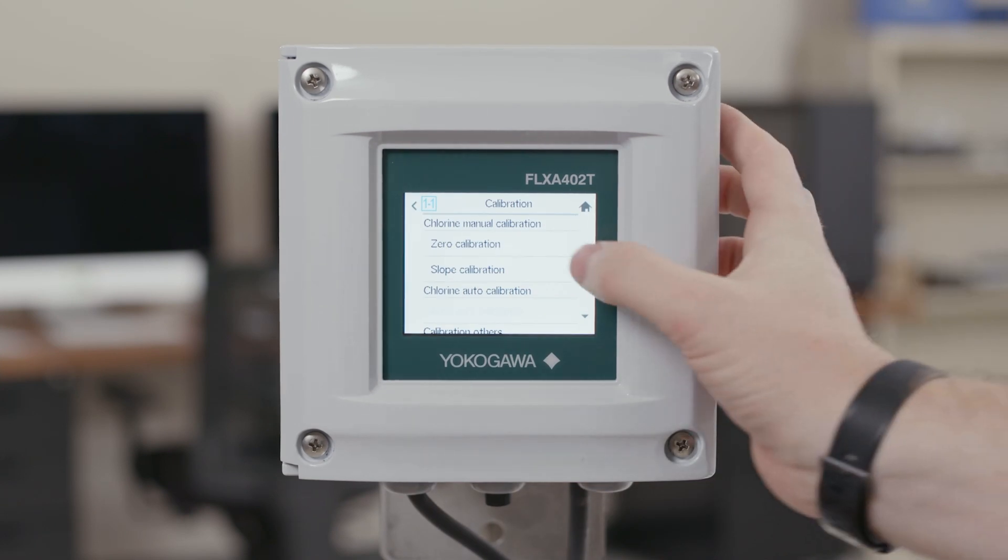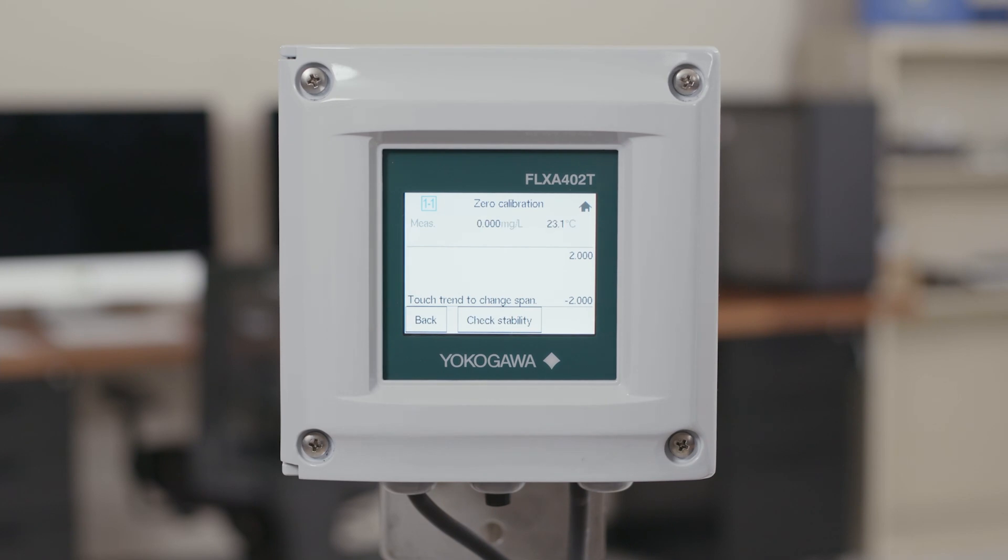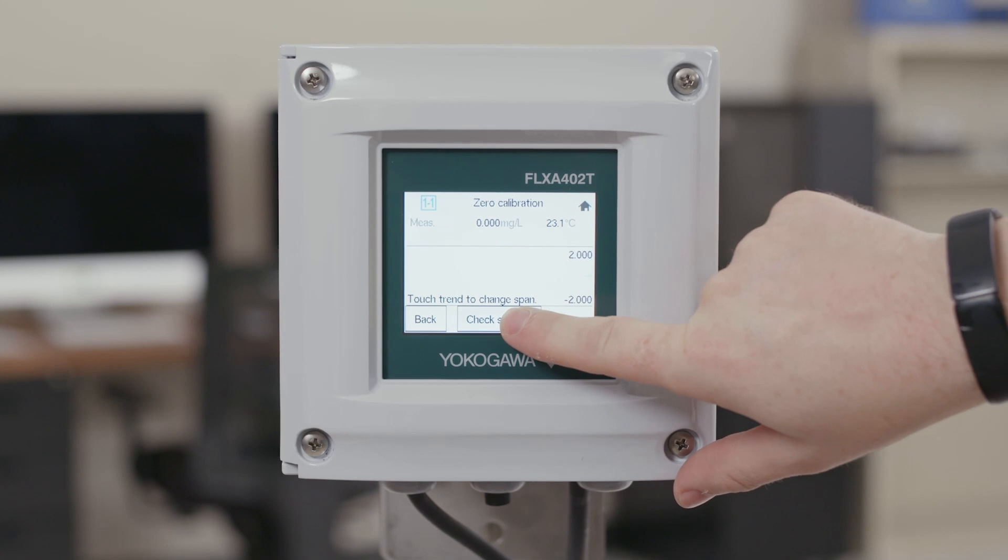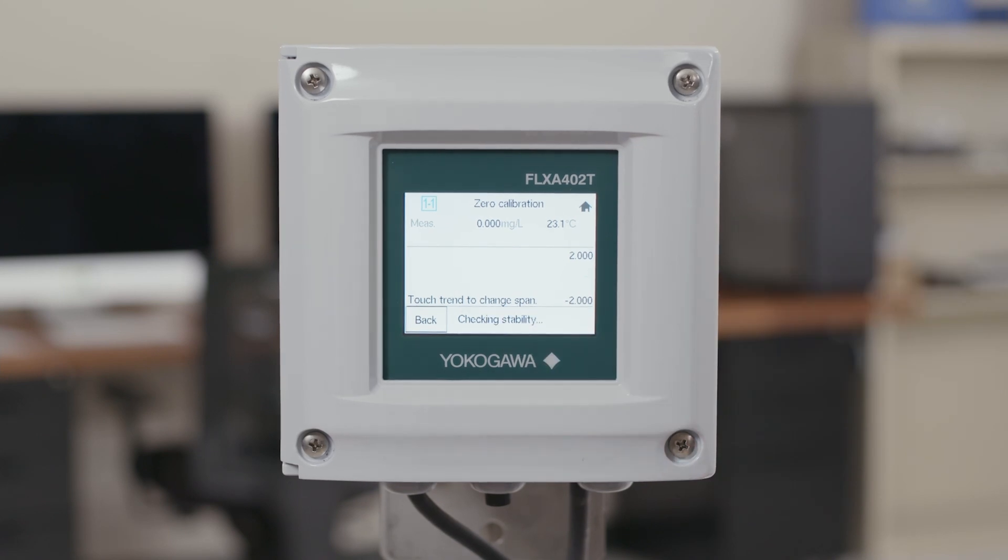From here you will select your zero calibration. This will make a screen appear that shows your current measurement as well as a back button and a check stability button. Once your reading on your measurement section has stabilized, go ahead and click the check stability button. This will allow the analyzer to measure stability and make sure that the reading is actually stable. Once it is stable, a button that says next will appear.